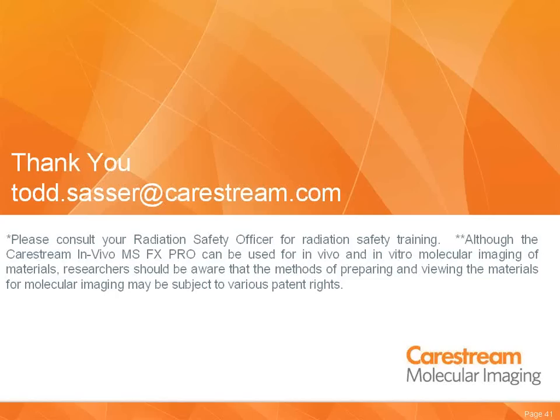Okay. What is the optimum exposure time for radioisotope imaging? It's the same as fluorescence and luminescence detection. It really depends on the intensity level and the signal intensity of your sample, but I would typically, depending on the isotope, do a higher bin setting and start out imaging at 4 minutes. You can always work backwards from that, but a starting protocol that I would recommend would be about 4 minutes and an 8x8 bin setting. And from there, you can gauge the intensity level to determine the exposure time.